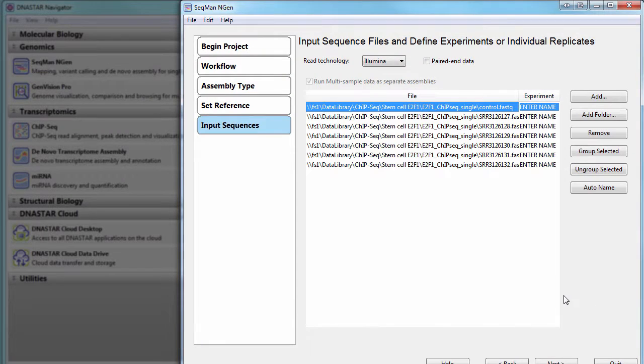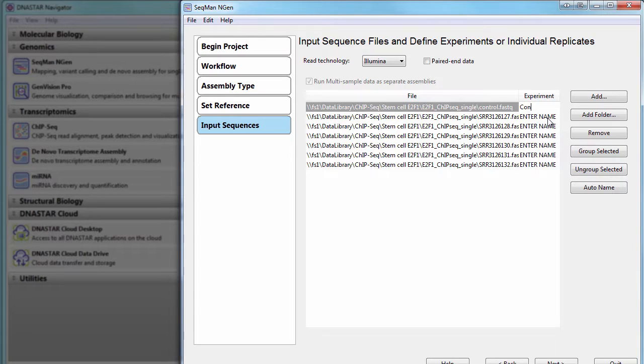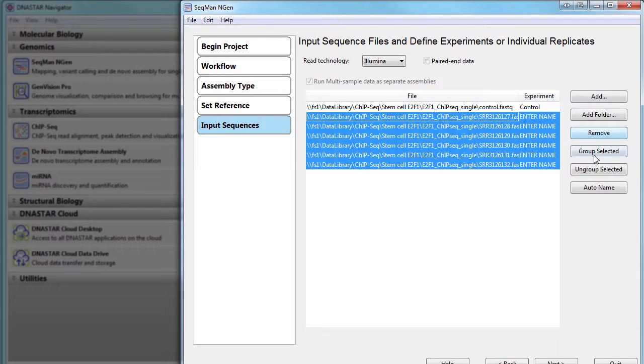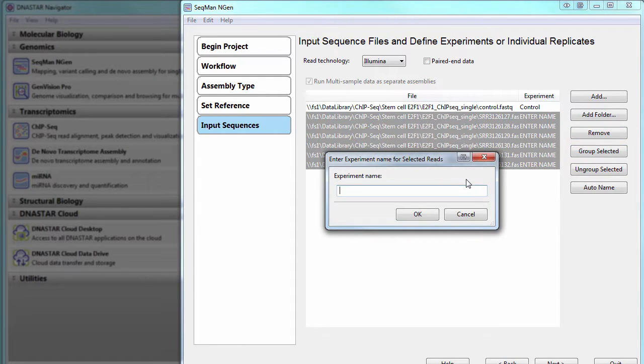Now we need to specify an experiment for each file that we've loaded. The first file is my control, so I'll label that control. And the rest of the files are part of an E2F1 ChipSeq experiment, so I'm going to group those and name that IPE2F1.